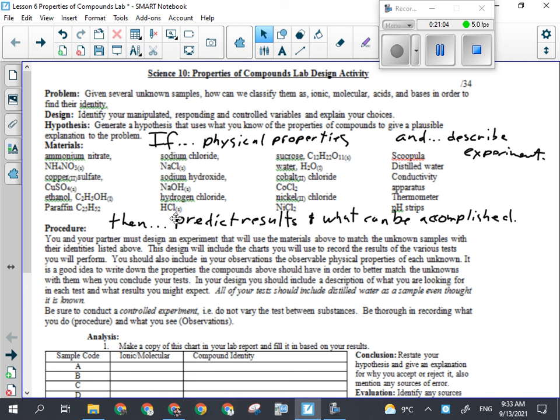You want to have enough room for a fair amount of water for your solubility, conductivity, and pH tests. If you put even half full with the compound, you'll never get it to dissolve. I would say somewhere between 1/4 and 1/3 full with sample would be lots. The depression plate. Yeah.